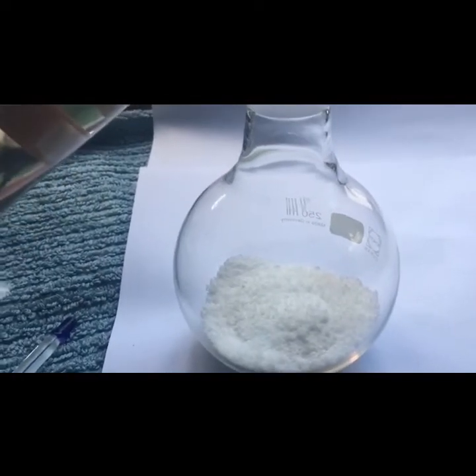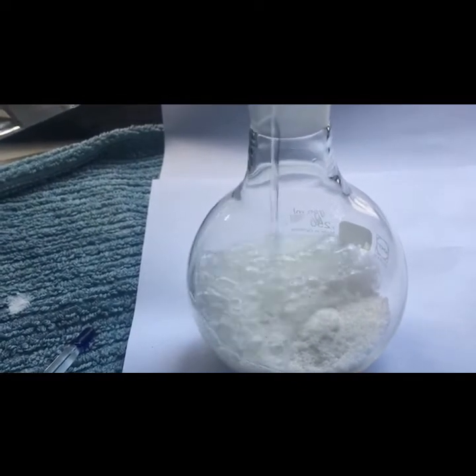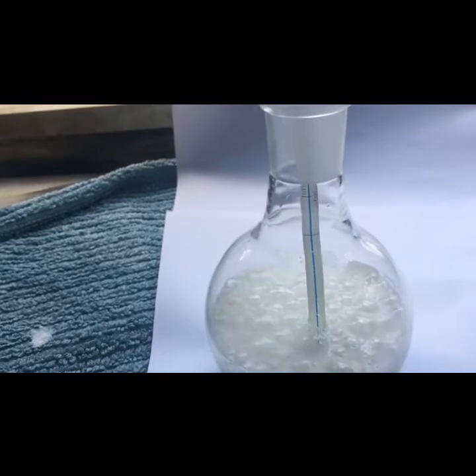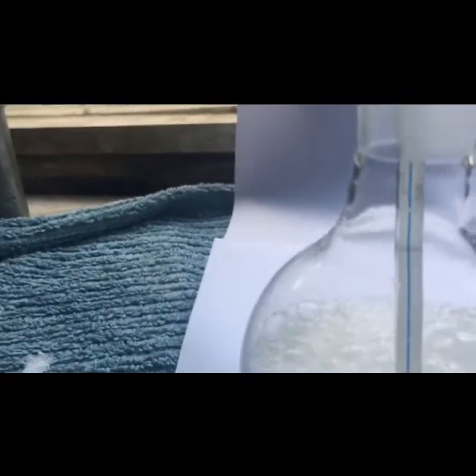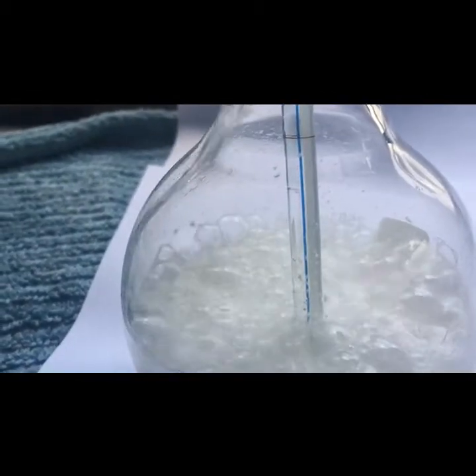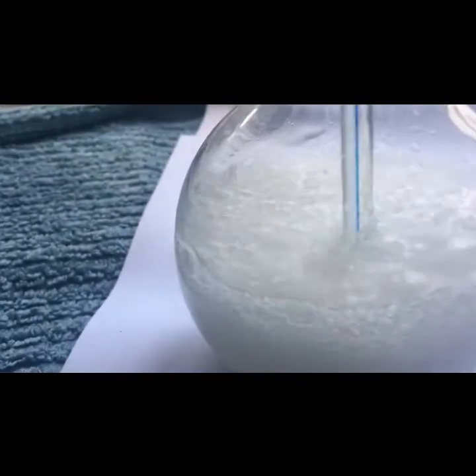Let's begin by pouring in the water, and you can see the bubbling happen when I pour it in. Try to pour it in slowly and not all at once. There's a chance this might overflow, since I don't like a lot of bubbling liquids, especially in a flask like this where it could burst like a volcano if you pour the water in at once. I can add a bit more water. Give it a quick stir, and you can see on the thermometer that it's already at 10 degrees Celsius, and this should get colder.